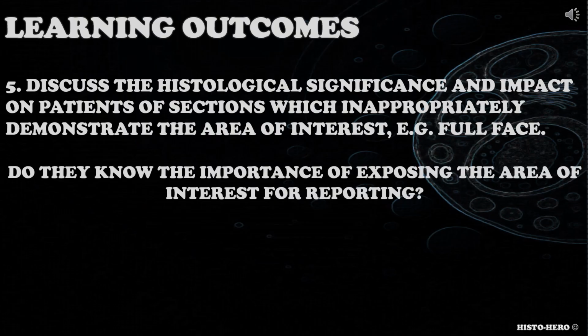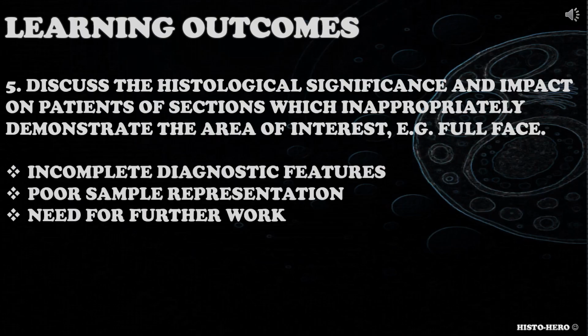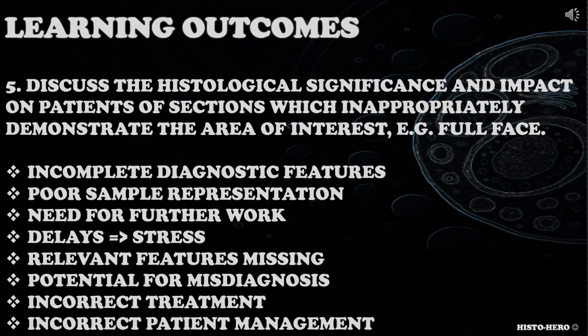Do they know the importance of exposing the area of interest for reporting? Candidate could consider incomplete diagnostic features, poor sample representation, need for further work, delay in reporting that can cause further stress to the patient, relevant features missing, potential for misdiagnosis leading to incorrect treatment or patient management.